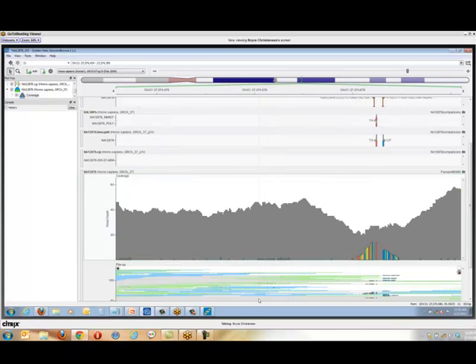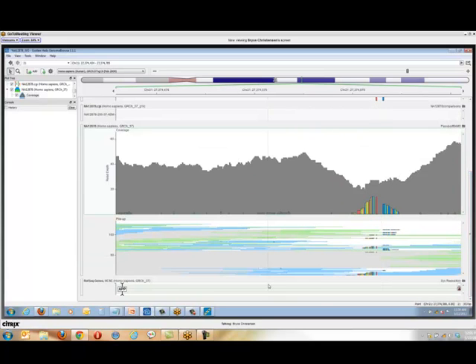But to really understand what's going on, and I can't see the little grab handle. This is one of those problems that I was afraid might happen. Scroll down. Okay, there it is.